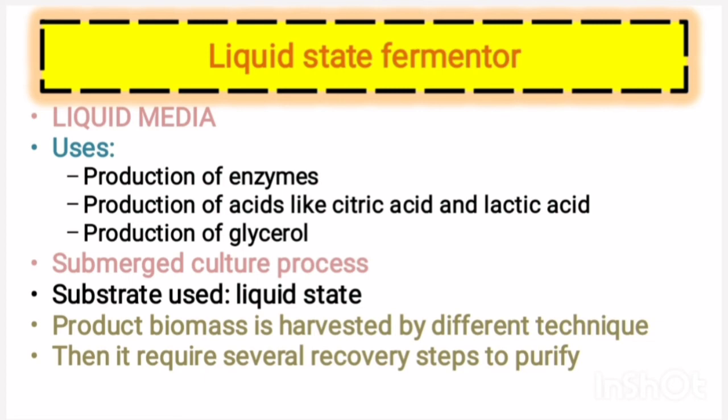Then we can discuss liquid state fermenter. It is also called submerged culture process. Here the liquid media is used. Liquid state fermenters are used for the production of microbially derived enzymes, acids like citric acid, lactic acid, etc. and also used in the production of glycerol.